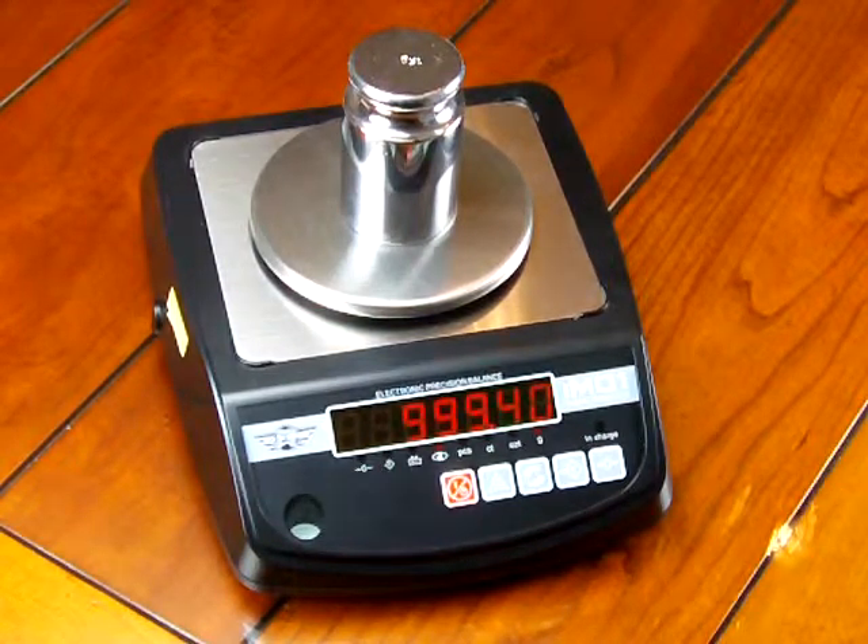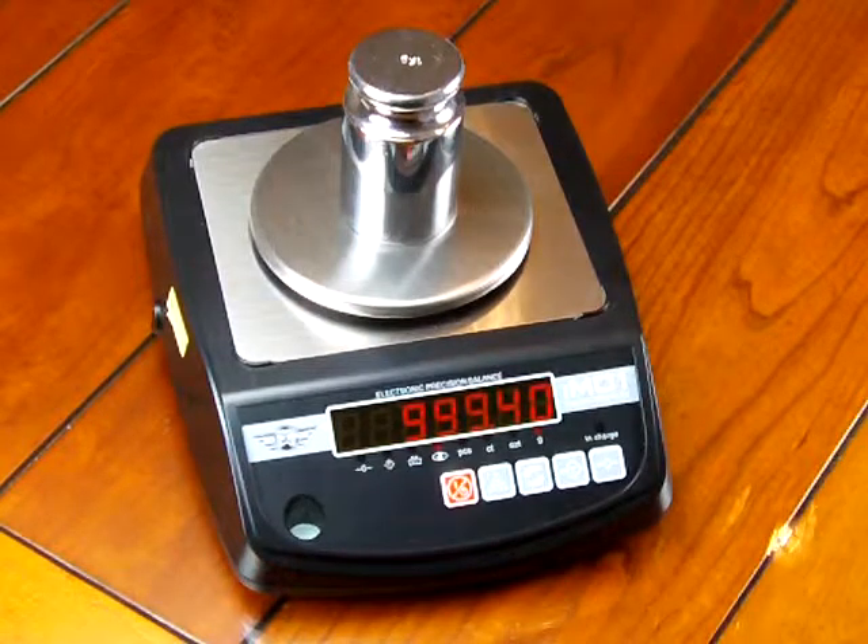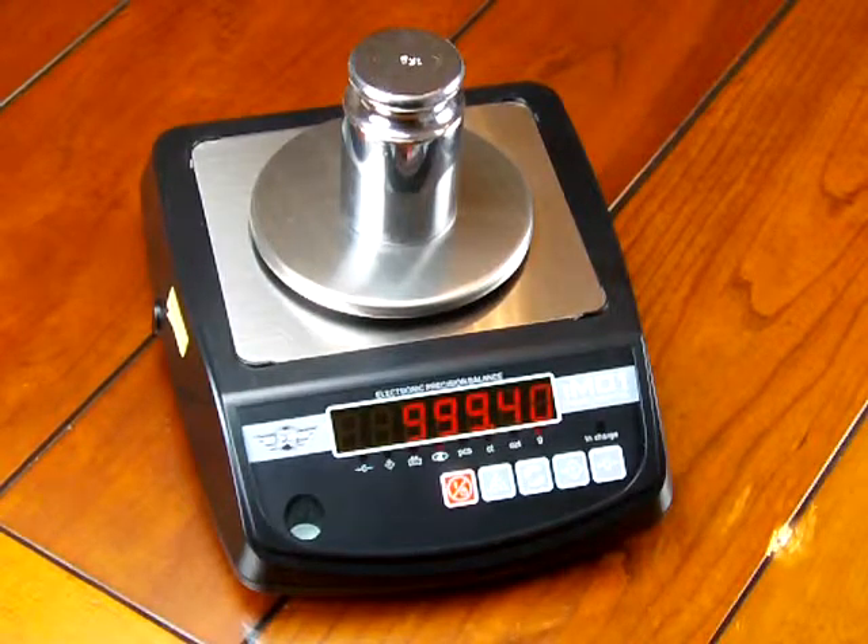The vast majority of people don't buy calibration weights because they just don't want to spend the money, and that's totally foolish. You really need to buy a calibration weight. These weights here are low cost ASTM class six weights — really, really affordable. And if you want to get the more expensive class one weights with traceability certificates, we sell those also. But again, we highly recommend you purchase the calibration weight.